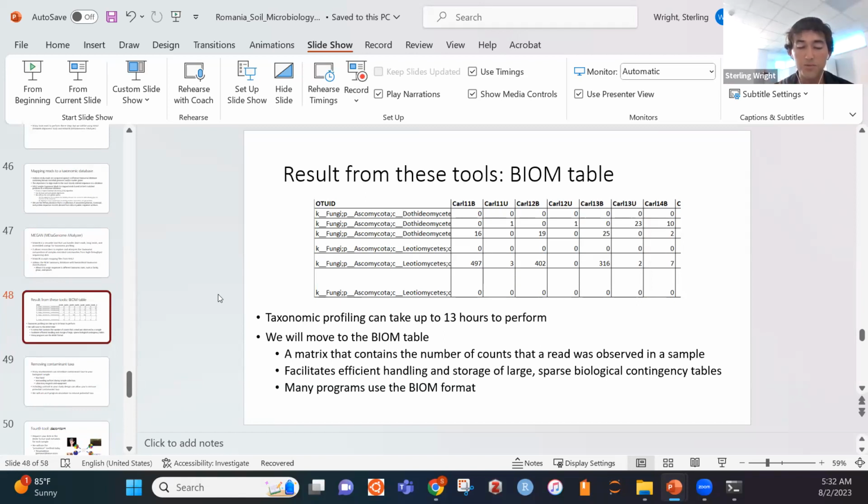The one thing about these tools is that they're extremely computationally intensive and require a lot of memory. It actually took us a long time to get our lab set up with these tools, especially with MALT and the database that we're trying to use. We were trying to use a RefSeq database that includes around 48,000 microbial genomes, which I think was 52 gigabytes. No, I think it was much more than that. Maybe around 70 gigabytes total.